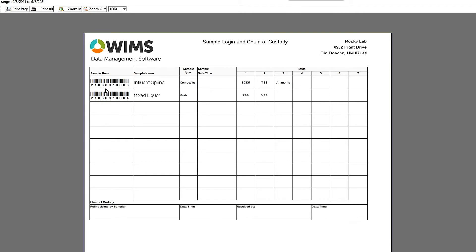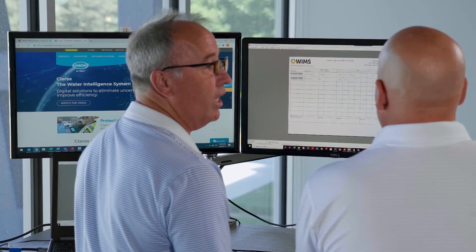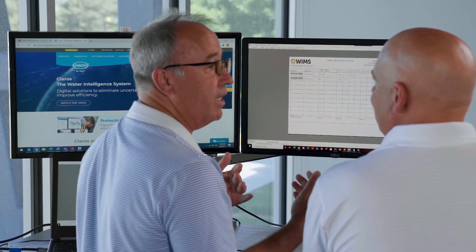The other thing that this particular customer needed was the ability to barcode. So we've added barcoding in. When you get your sample in, you hit the barcode, and in LabCal, it'll just move you right to that sample. And again, this is really important for customers that aren't going to have like two samples a day like here, but maybe 20 or 30 or 50 samples a day. Barcoding becomes much more important because it allows you to enter your data more accurately. Now that is cool.